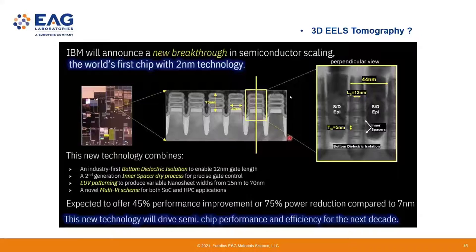Yeah, okay. And I guess I was thinking as well, you'd probably need to consider the probe current much more carefully when you're doing tomography rather than just a standard STEM-EELS experiment, because presumably we're irradiating the area way more, because you have to do a series.